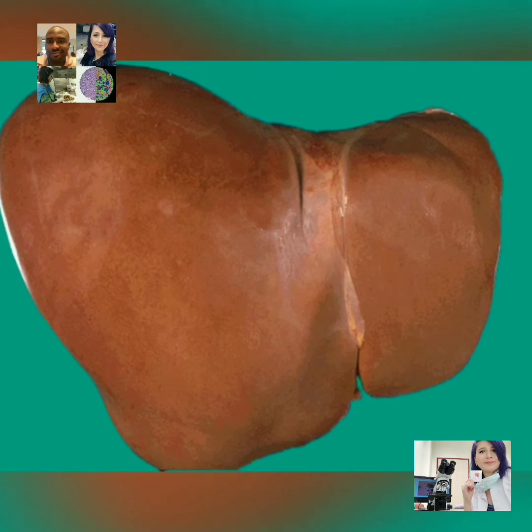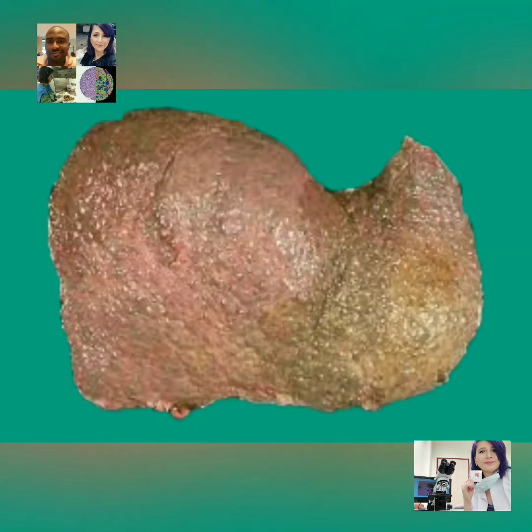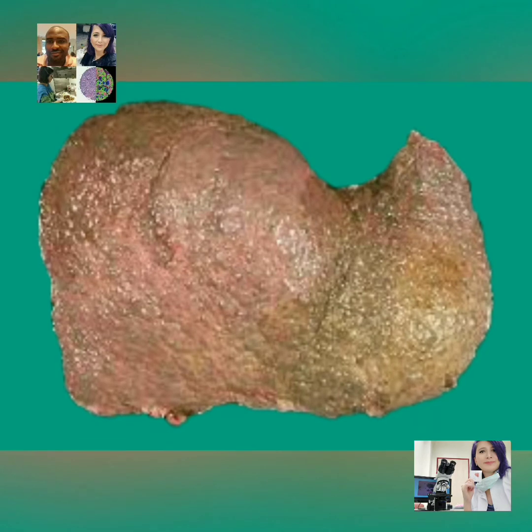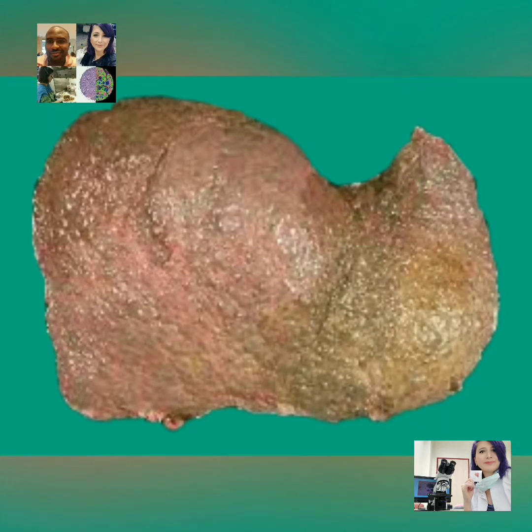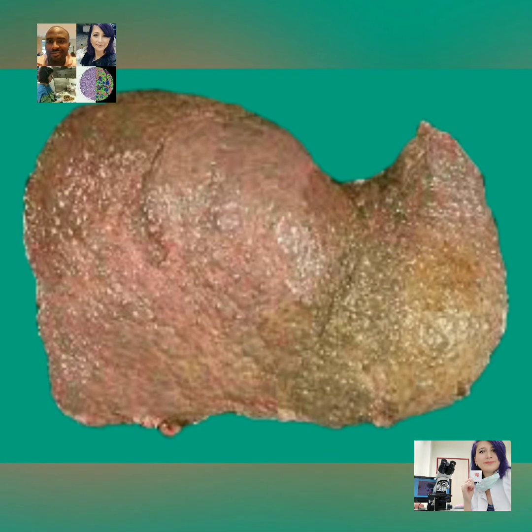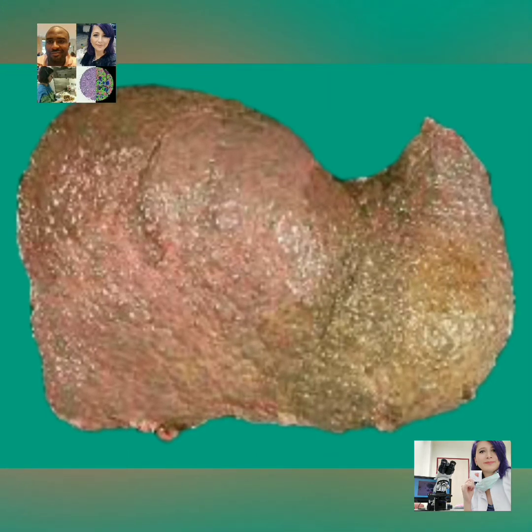These samples usually go through various ancillary tests, which could include histochemical and immunohistochemical stains, in addition to our routine H&E stains. At every time, it is important to note that any diagnosis rendered, for example in the case of malignancies, will require specific staging information for adequate treatment and prognosis.